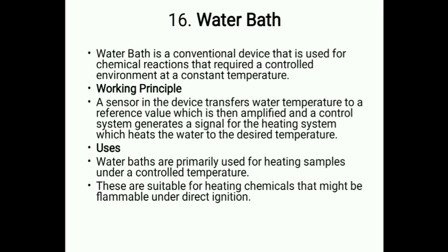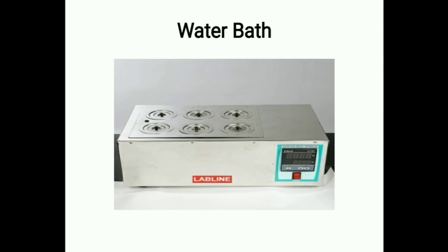Talking about the uses, water baths are primarily used for heating samples under a controlled temperature. These are suitable for heating chemicals that might be flammable under direct ignition. So this is a water bath.